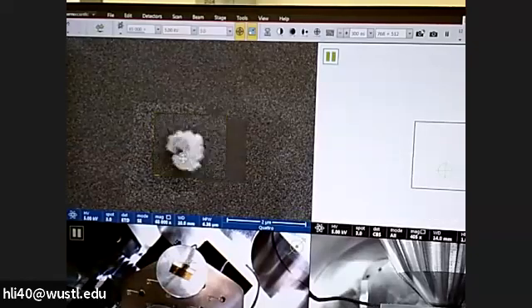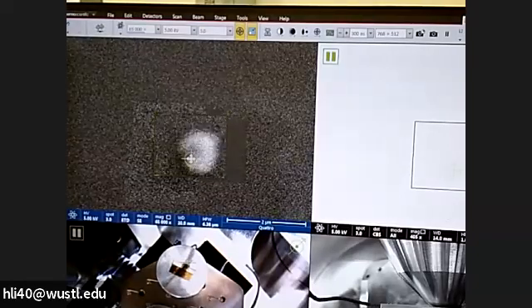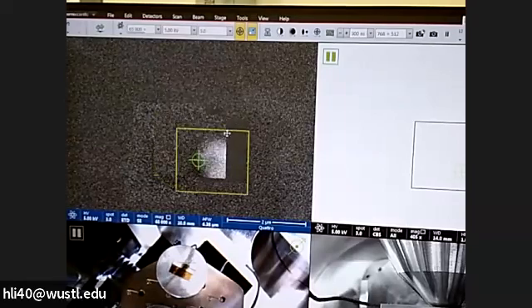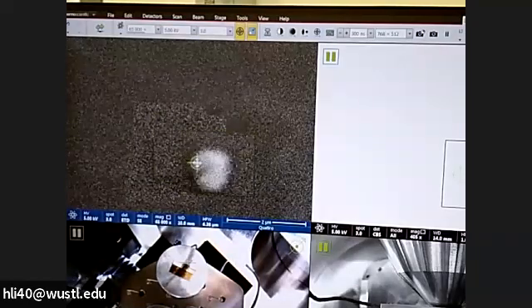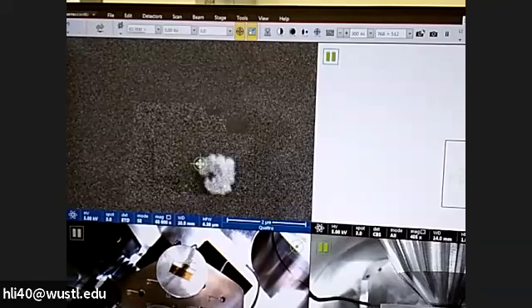So now you will see it's mostly left and right. We are going to move left and right of this target to stabilize it. So it's much better now. You can either double click the particle to move it back to the screen center, or you can simply move your window there. It's much better. We can fine tune a little bit. What you see is the image become focused and blurry, focused and blurry. The shaking is minimum.